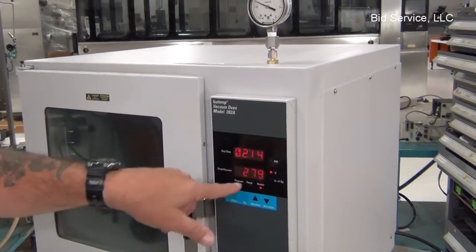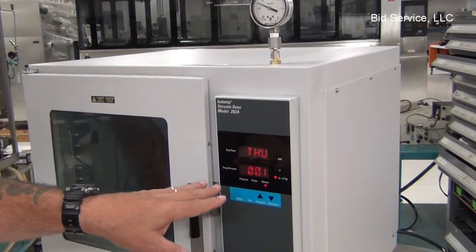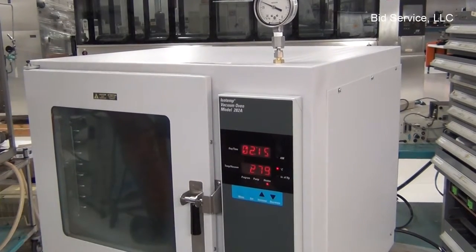You'll notice that the display shows the temperature. I've got it set to 280 and it has a difference of plus or minus 2 degrees. We're at 279.